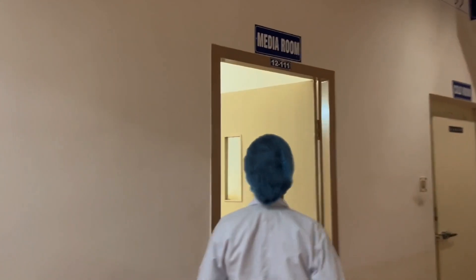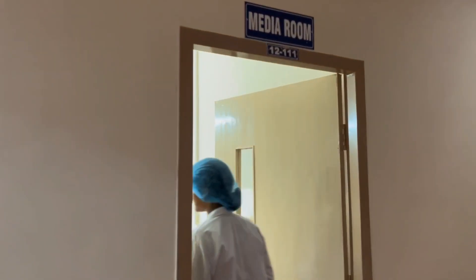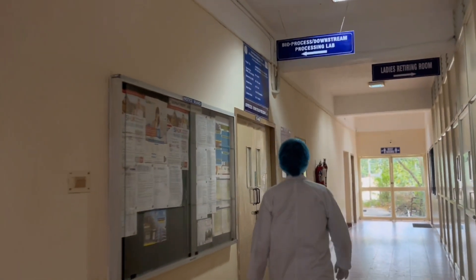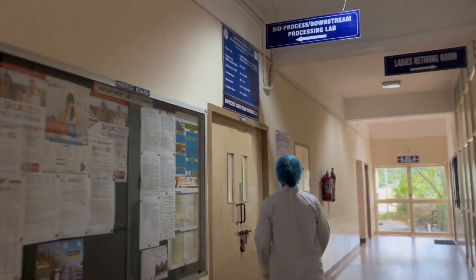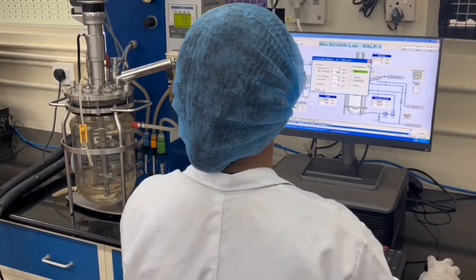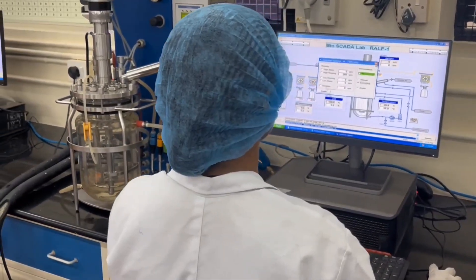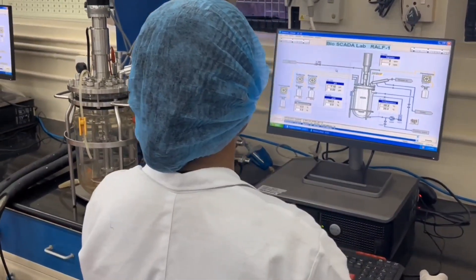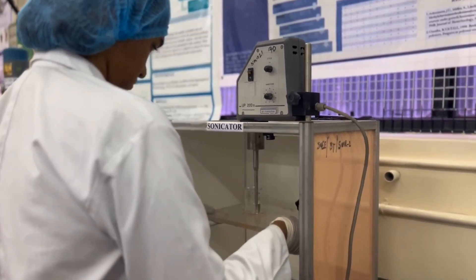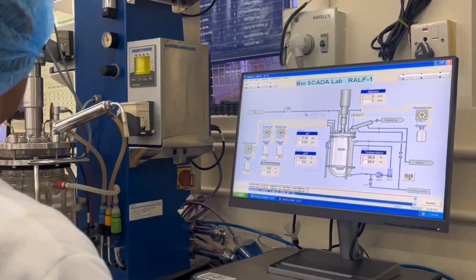I am Jyotsna Aar from Finalear Biotechnology. My field of interest is environmental biotechnology, for which I will be using the downstream processing laboratory. The laboratory has many highly sophisticated instruments, for example a homogenizer, lyophilizer, ultrasonicator, and bioreactors.